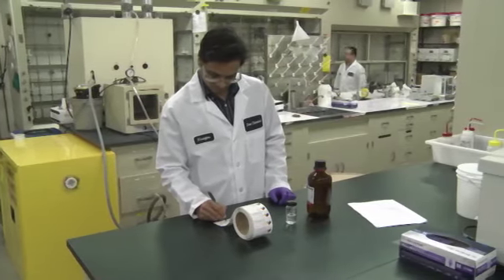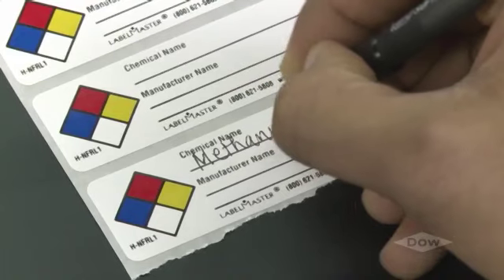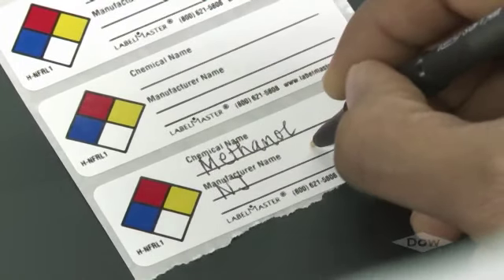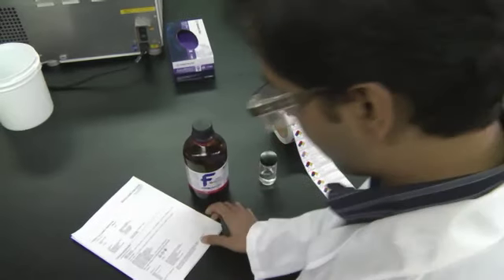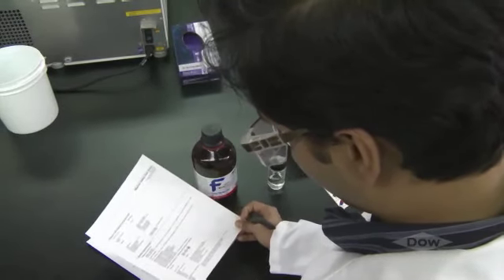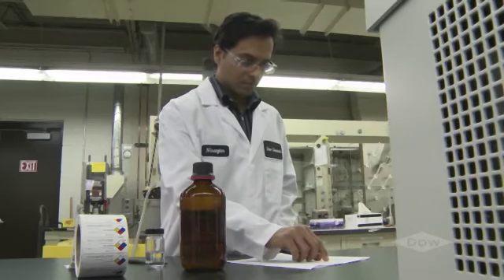First, what makes a good label? NJ realizes the label should have the name of the person who owns the sample, the date it was labeled, and the full chemical name of the material. A good label will also define any hazards associated with the material inside. So NJ researches and includes information about potential hazards.